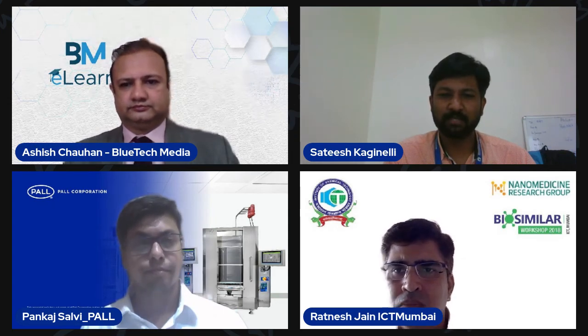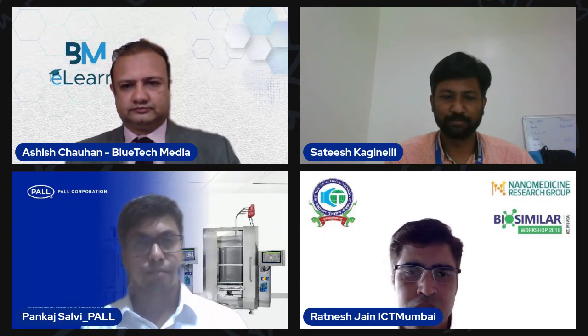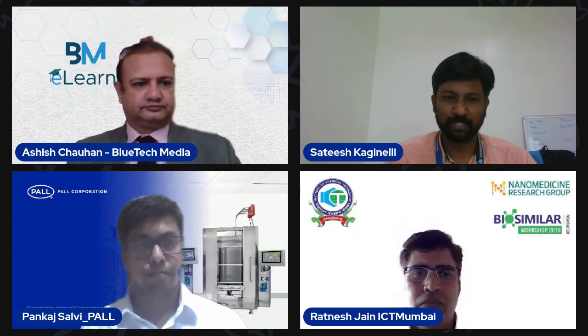There are already well-established heating pads available for heating single-use reactors. There is no issue. And as far as recycling is concerned, you can initially decontaminate the single-use reactor, then you can recycle it. You can validate that process. I think this answers your question.